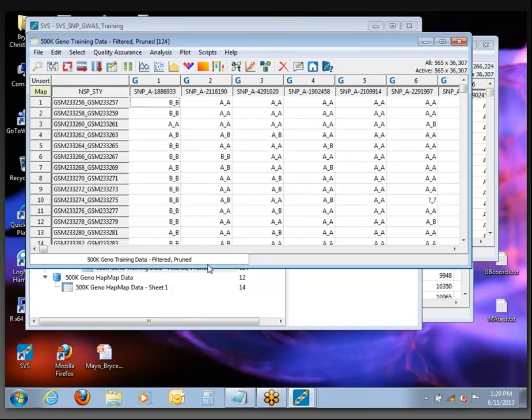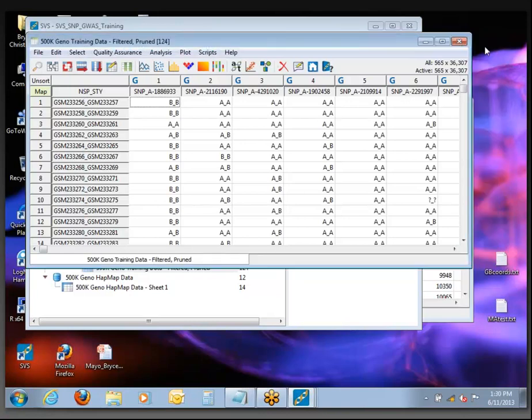The next step is Part 4 in the tutorial document — I think we're going to skip that one because it takes quite a while to compute. But we looked at that a little bit this morning. You get output where you can see all of the pairwise relationships both in the matrix view and also in the list view, and when running that you'll usually want to use this kind of pruned subset of SNPs.